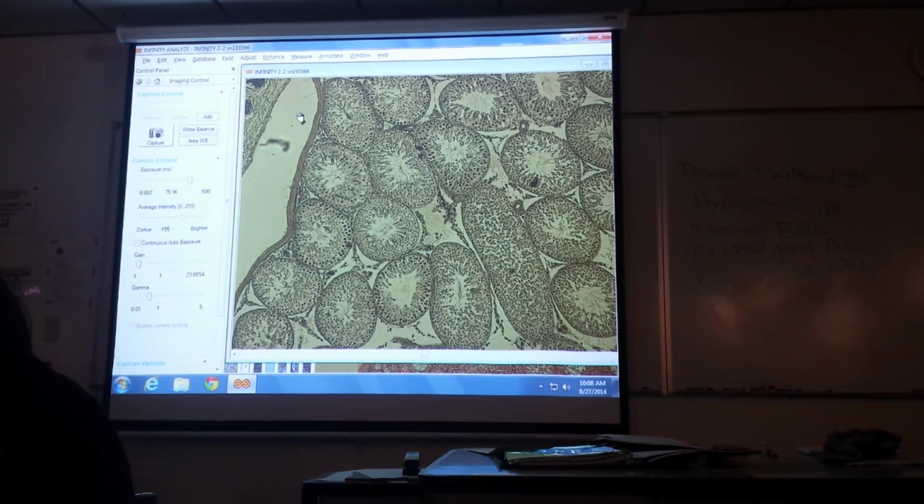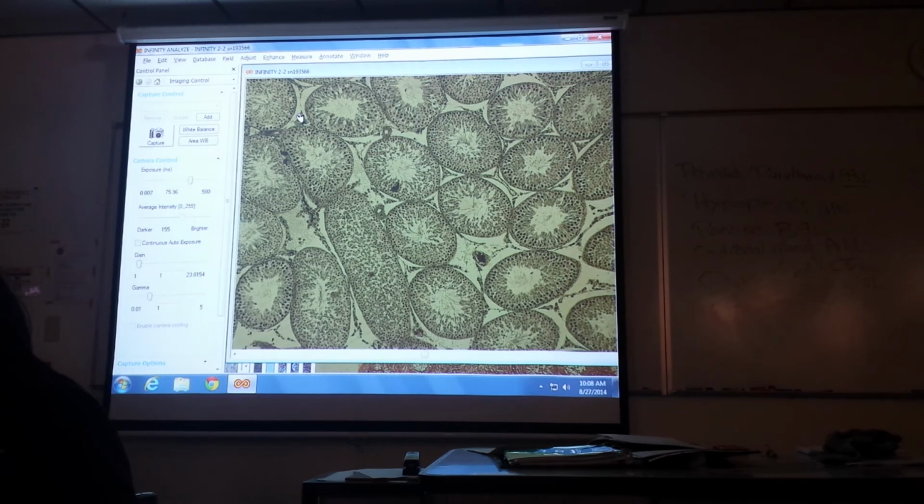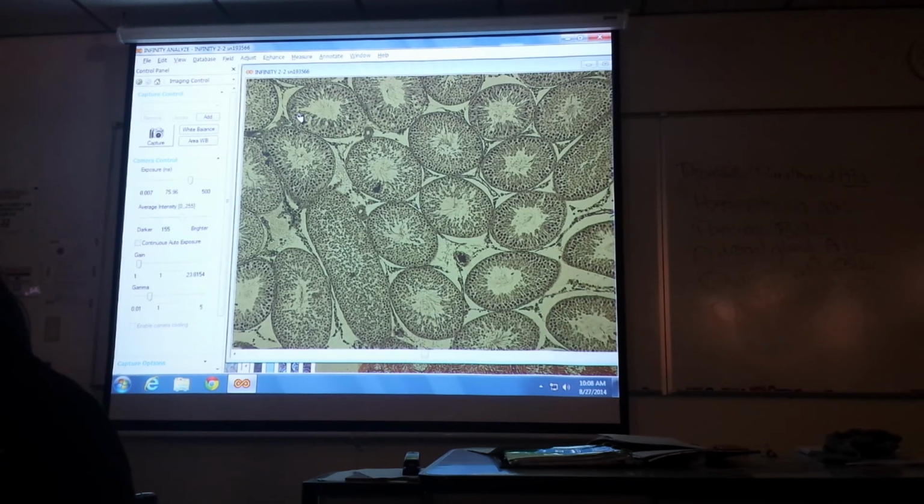So I have interstitial cells. Do I have seminiferous tubules on there? Yes. Okay. One produces sperm, one produces testosterone, which is why we're studying it here. Do you see a bunch of cut tubes? That's a cut tube. That's a cut tube. These are all cut tubes with a lumen. Squiggly little things inside are probably sperm. These are the testes.